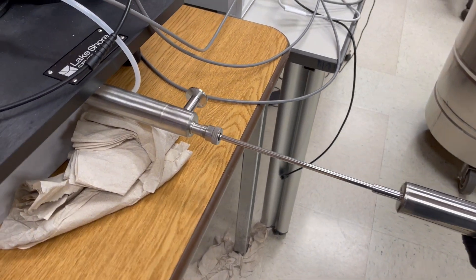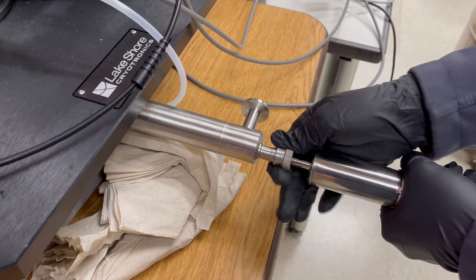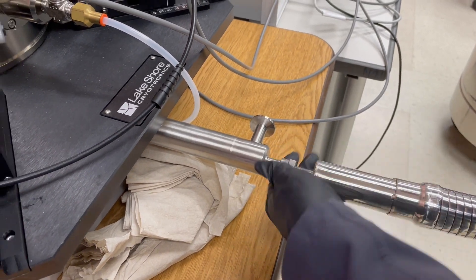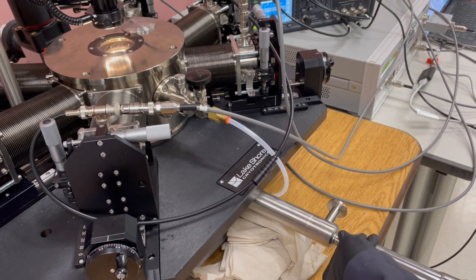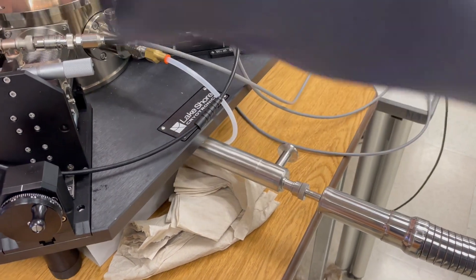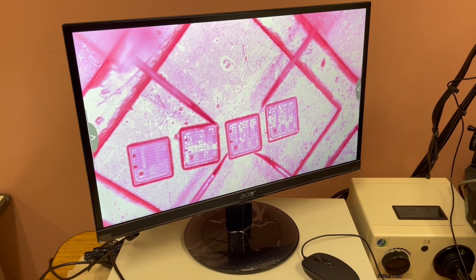And do it slowly. If there's a ring there, you don't want to push inside the ring, right? And close it. Turn it all the way. Make it tight. And before that, make sure that we have moved the broke tip away because they're going to contract and then you will hit each other.